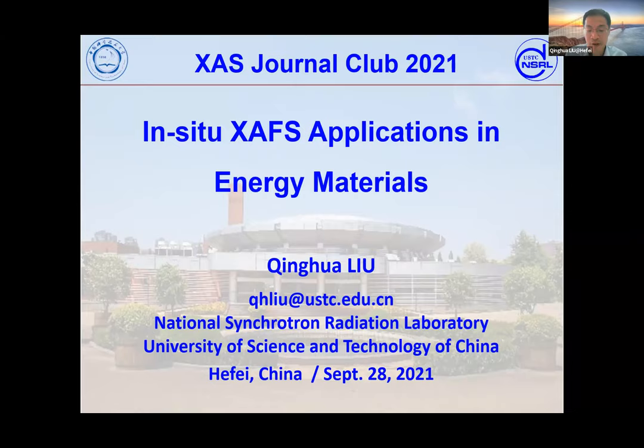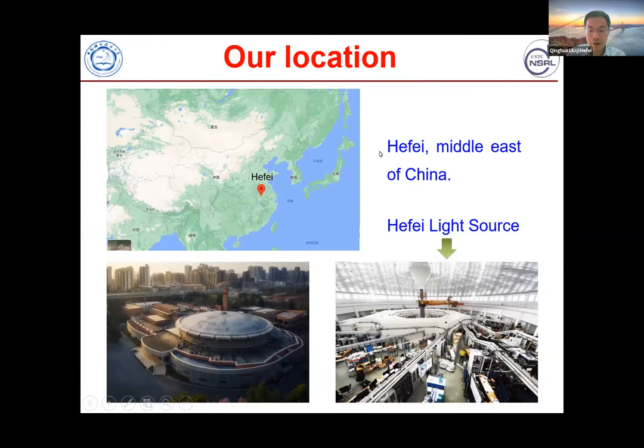My research mainly focuses on the XAFS applications in energy materials. So today I will give a talk about XAFS applications. Before the talk, I briefly introduce our lab. Here is Japan, here is South Korea, and here is China. Hefei is located in the middle east of China. This is our Hefei light source. It's a small synchrotron ring. Its circumference is about 70 meters. The electron energy of the storage ring is 0.8 GeV.